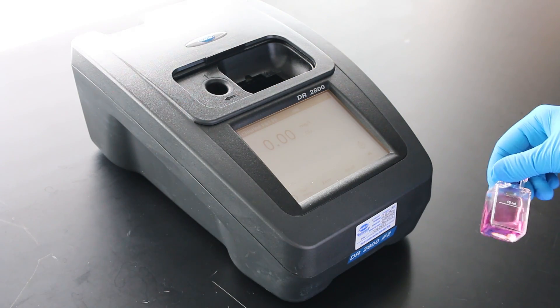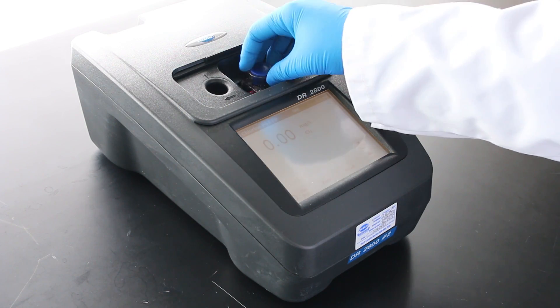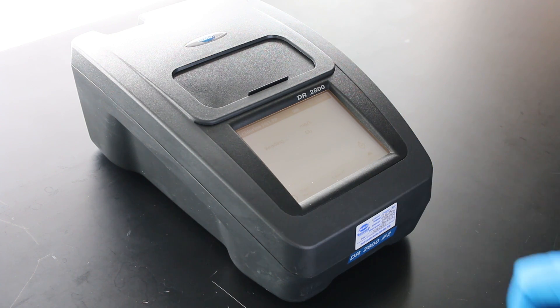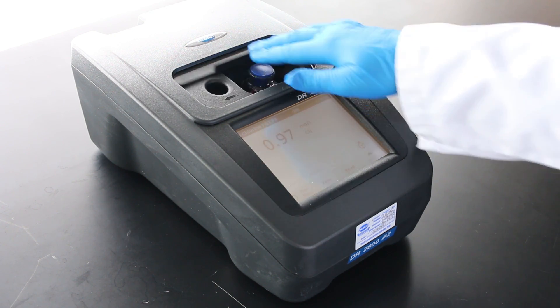Within 60 seconds of the addition of the DPD reagent, insert the sample cell into the instrument and read the sample. The results will show in milligrams per liter of chlorine.